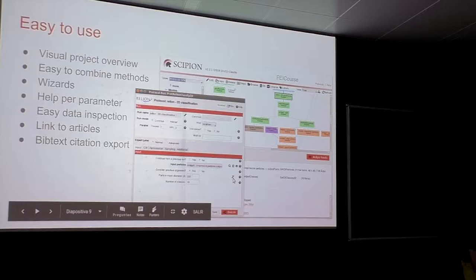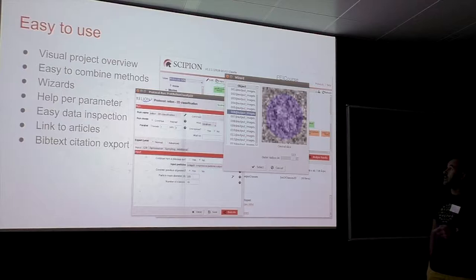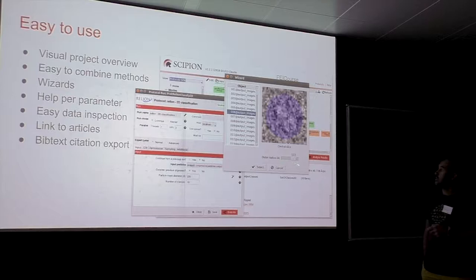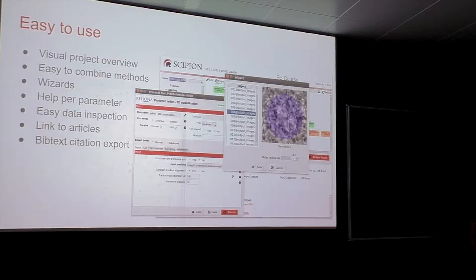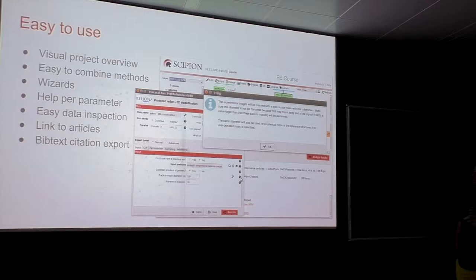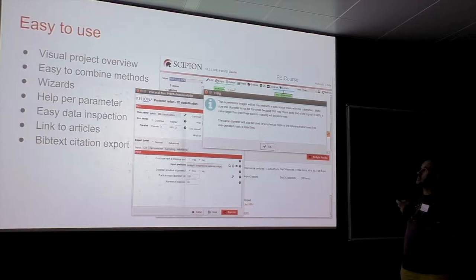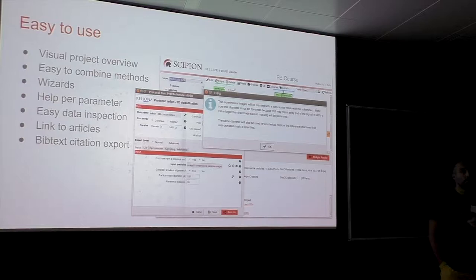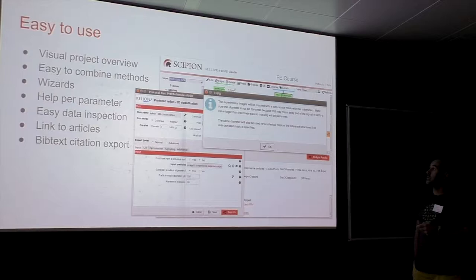You can also have wizards that help you decide on parameters. For instance, there's a wizard for the particle mask diameter for Relion 2D classification — it shows your particles and helps you decide the outer radius visually. Help is also incorporated into each attribute: quite often you have a nice description, possibly from the Relion manual, so you can see what Relion says about that parameter directly in the interface.